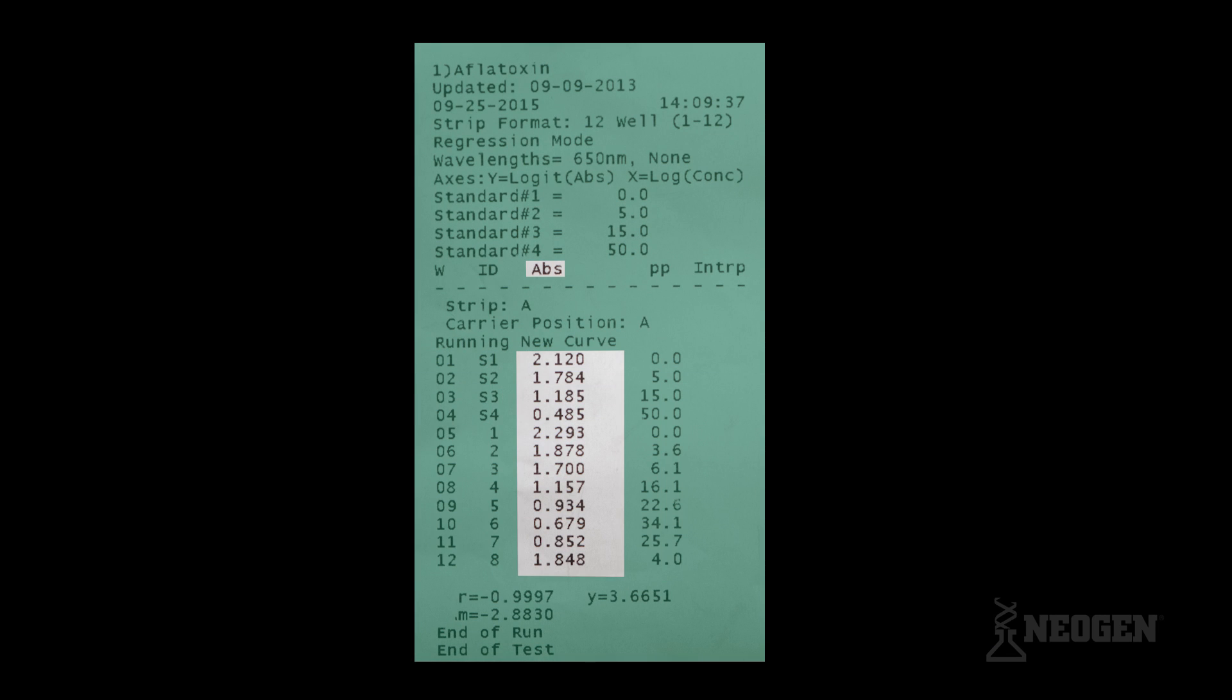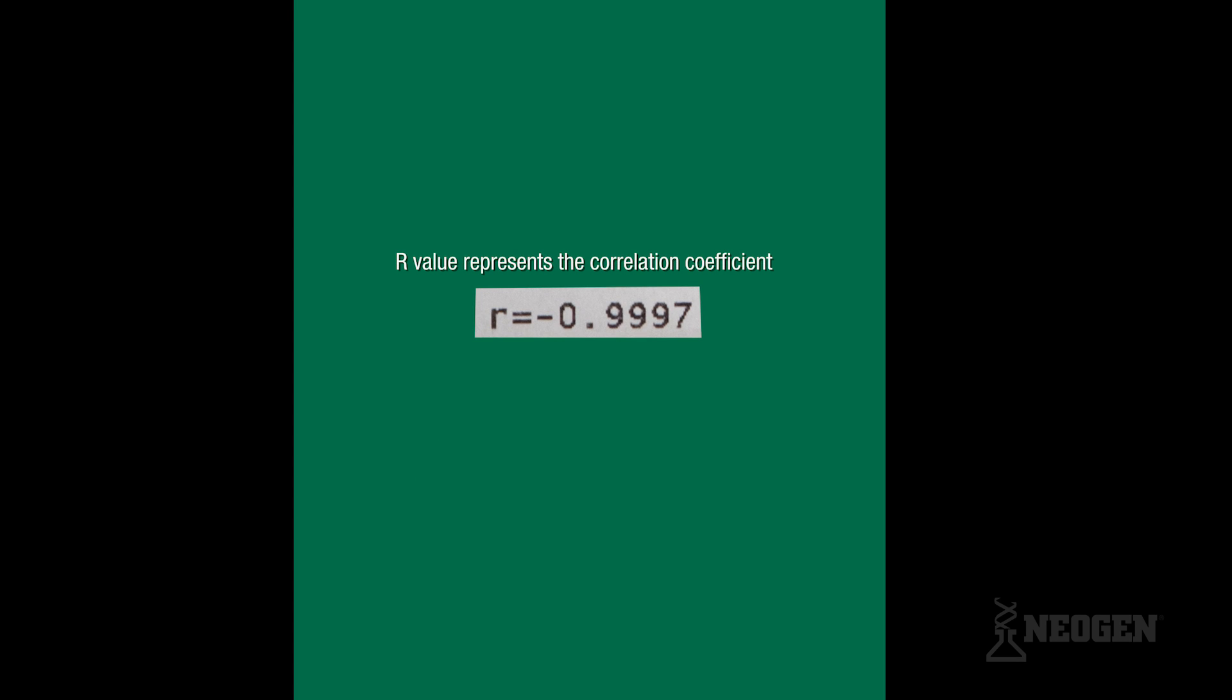The reader will print out the receipt with quantitative values for controls and sample. The middle column is the absorbance of each well. The right-hand column shows the exact parts per billion of the controls and sample. Below the columns, you will see the R-value. The R-value represents the correlation coefficient. If this value is less than 0.98, the test is invalid and must be run again. This value ensures the test was performed correctly.